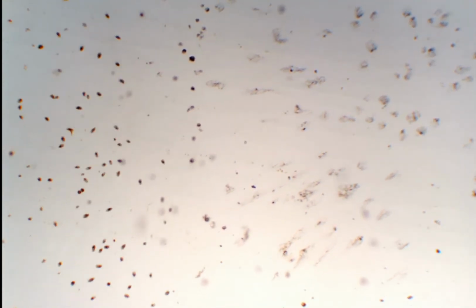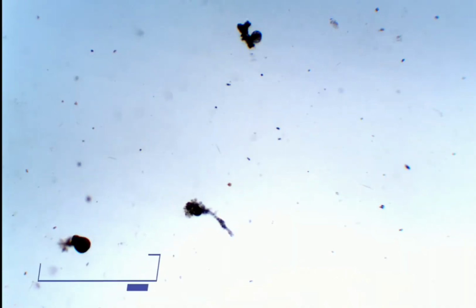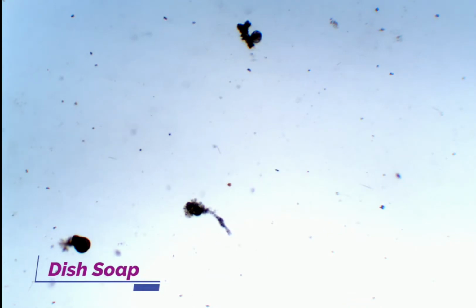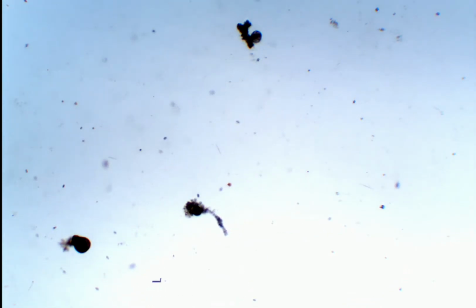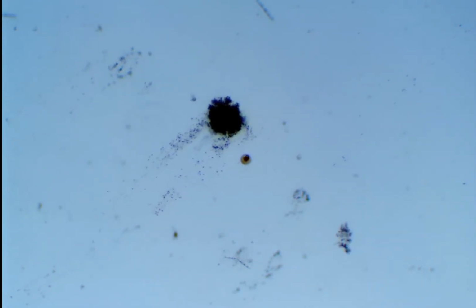So here you see another close-up of the organisms dying. This is in the dish soap. So when we add dish soap to microorganisms, this is what happens to them. See? Instantaneous, as if there's an atomic explosion on a micro level. Now dissolve. Completely diluted.